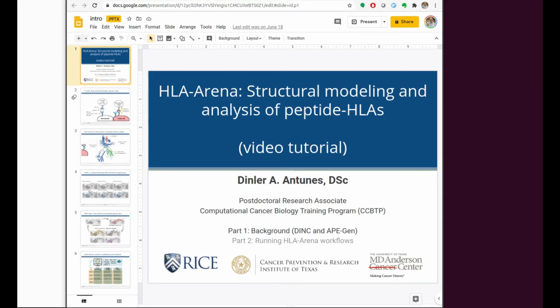This is a two-part video tutorial on the use of HLA-Arena. In the first part, I'll give you some background on the importance of modeling peptide-HLA complexes and on the methodologies behind some of the tools included in the HLA-Arena environment. In the second part, I will demonstrate how to download and execute the HLA-Arena workflows.